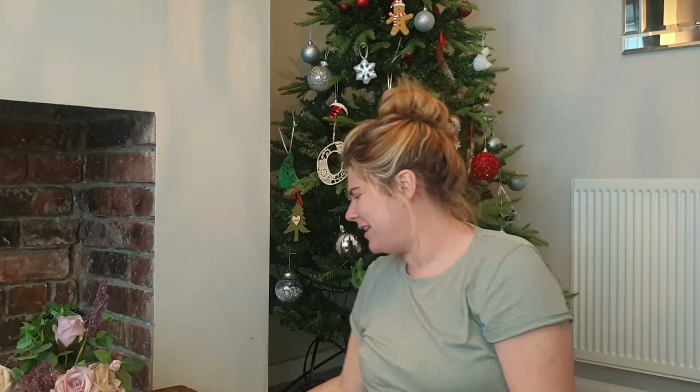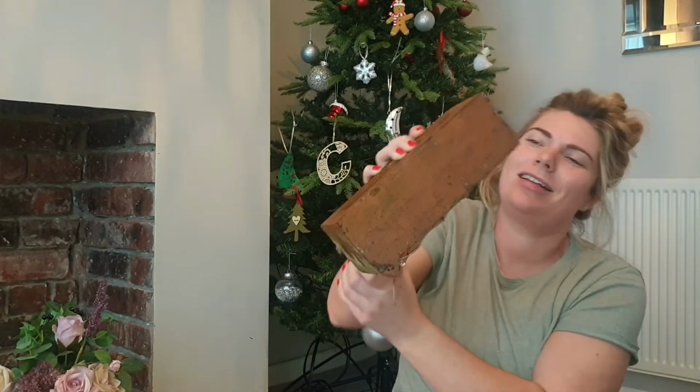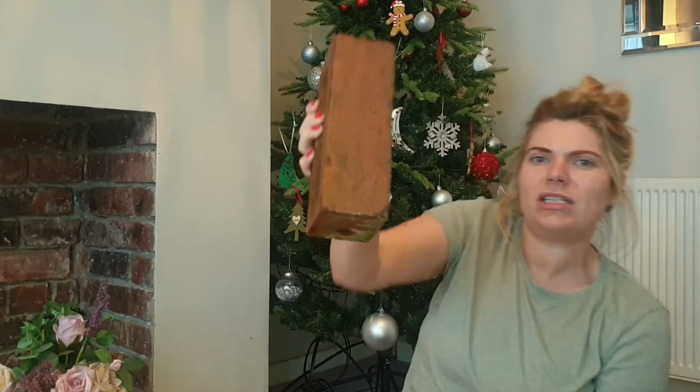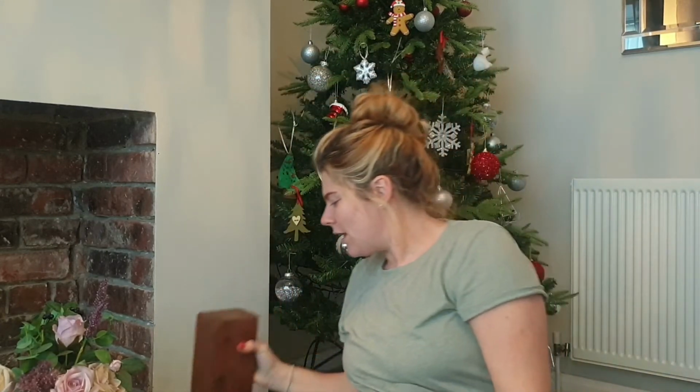And for some reason, they decided that calcium turns brick red. Now, it's more of an orange red to me, a burnt orangey red, but they will only accept you saying that if you were to put calcium in a flame test, it will go brick red.